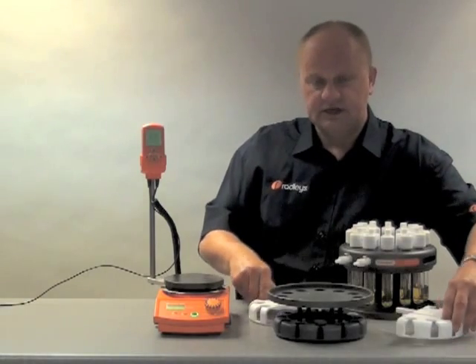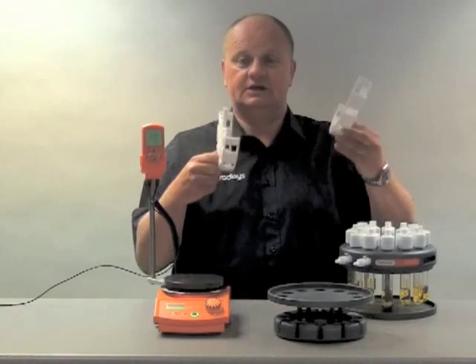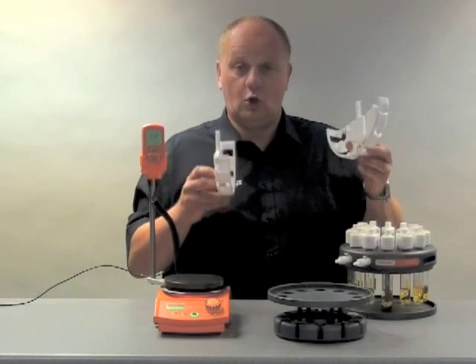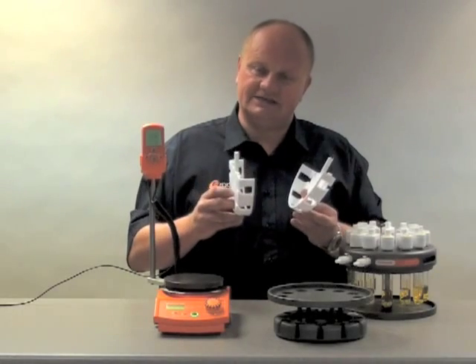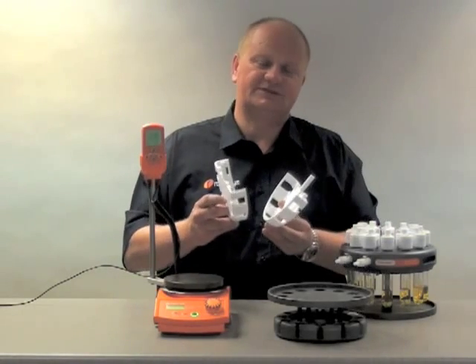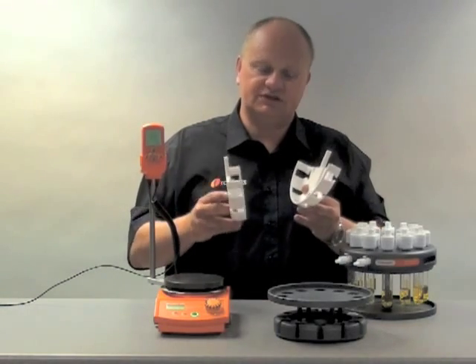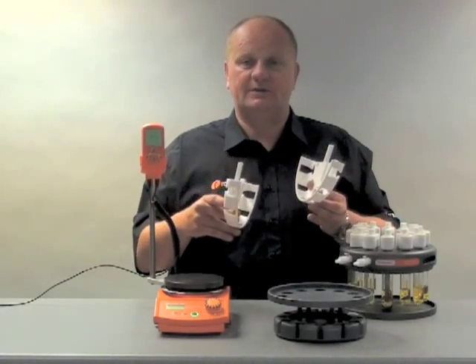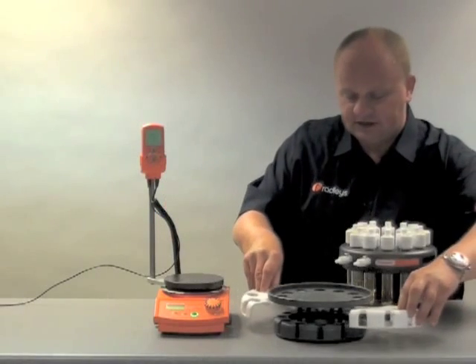One of the changes to the Carousel Plus is that we've introduced these insulating plates. These insulating plates offer two features basically. One is that they insulate the base and therefore improve its heating — it requires 36% less energy to heat this base compared to the old base. Also, it reduces the temperature of the base externally by 50%, which prevents accidental burns. These are made from solid PTFE.